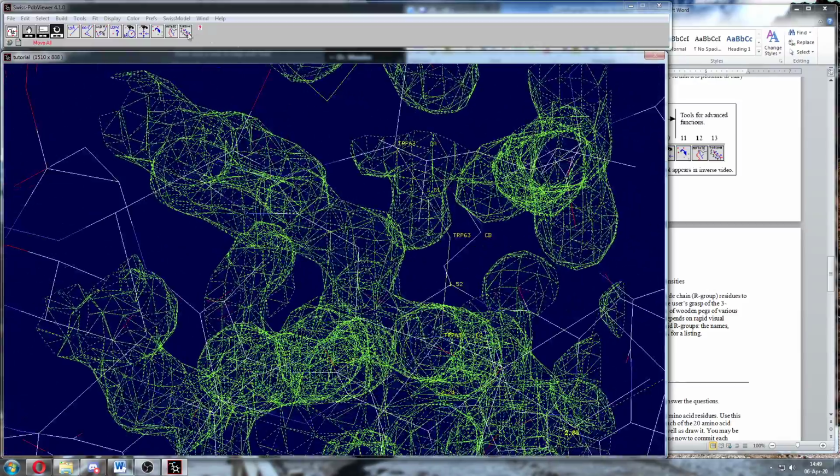Click on torsion, click on any atom in the now histidine molecule, right? And some arrows will pop up. Do not alter the arrows underneath the torsion. Those change the phi and psi angles of the backbone, and we won't be changing that. They're going to be correct. The 2 on the side means that histidine has 2 bonds that can rotate. If it had more, there'd be more arrows here. So histidine has this bond that can rotate.